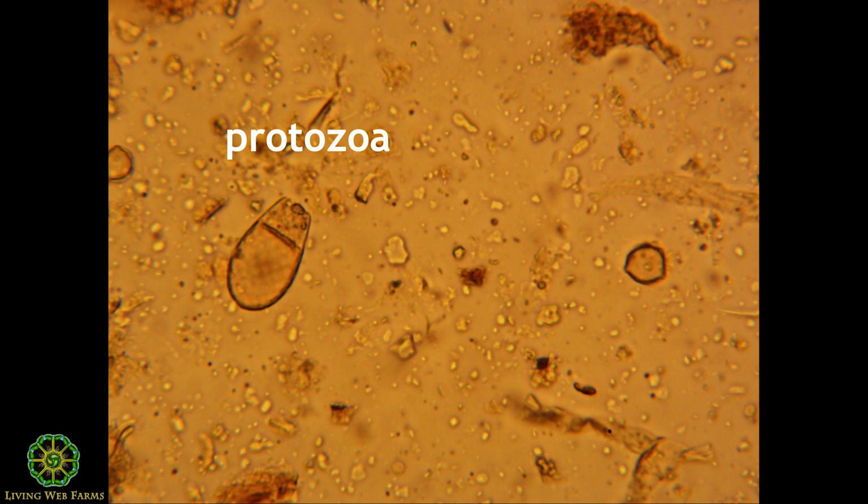Protozoa: the biggest thing on the screen is what I want you to focus on right now. That's a testate amoeba, and it looks like it might have very recently died in this photo because I don't see a lot of its internal plugs. They take a plug out of the soil solution, including bacteria, and then sit there and digest the bacteria. It's very rare in a soil sample that you've shaken up to see an actual amoeba that is outside of a testate. The testate is a protective little home for the amoeba.